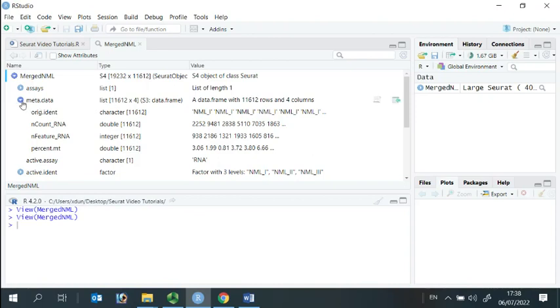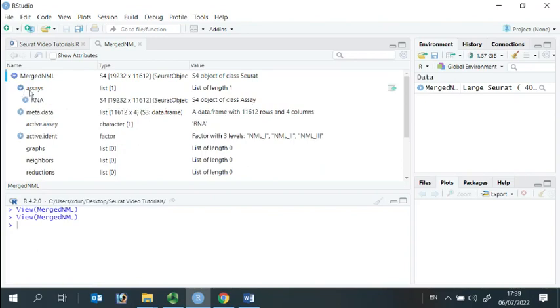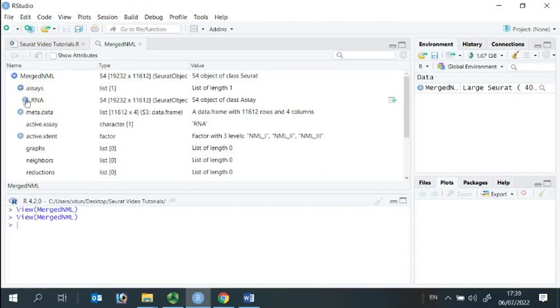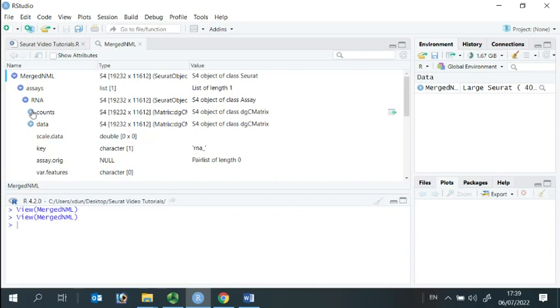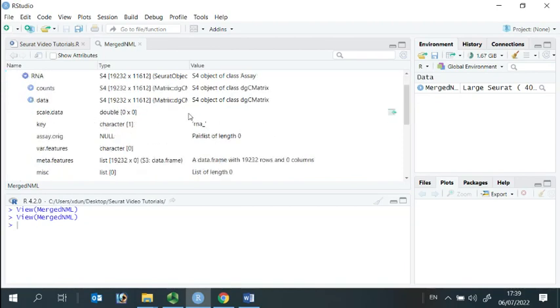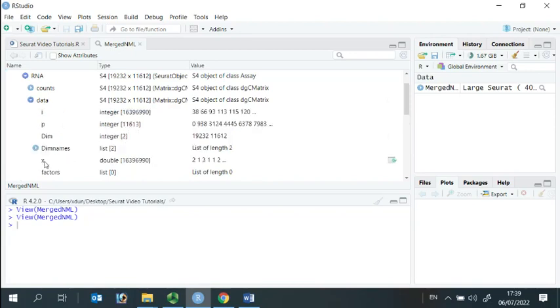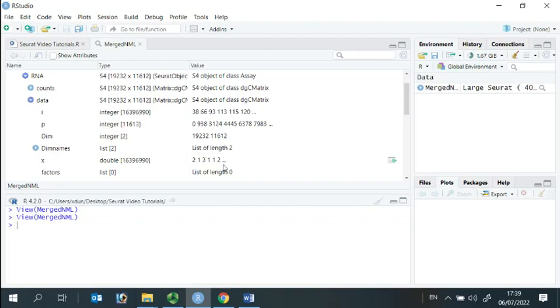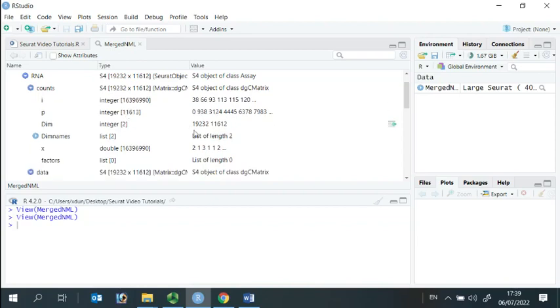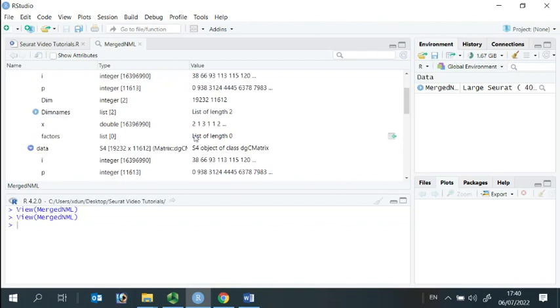We store the original sequencing data and our analyzed data in this section. The original DGE matrix data was stored in the counts. We store the analyzed data in the data section. Here we store the normalized data. At the moment, it looks the same as DGE matrix data because we haven't done the data normalization yet.